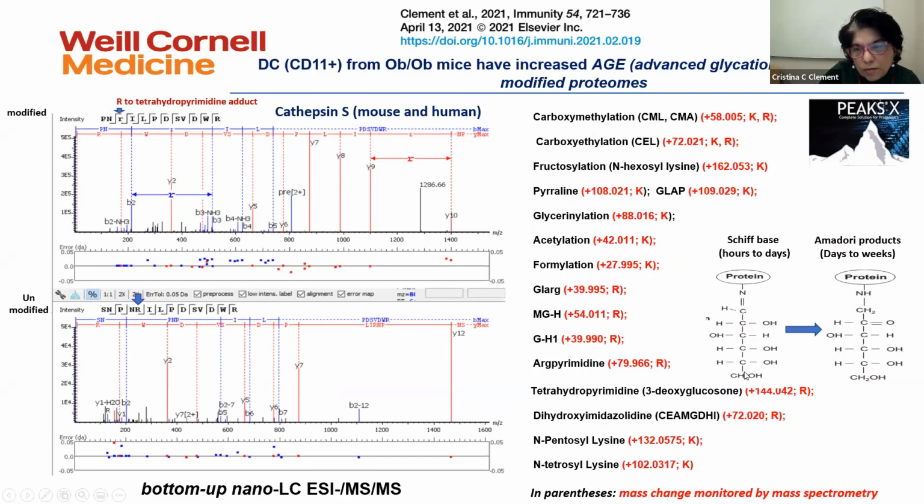We are looking at the Schiff-base type of PTM, which are mediated by carbonylated moieties from oxidized sugar like methylglyoxal, with the amino group of different proteins. These Schiff bases transform into Amadori adducts and they get reduced. So we have all these varieties in PTM which are identified in the proteome of the OB high-fat, high-fructose mice as compared with control. They are increased.